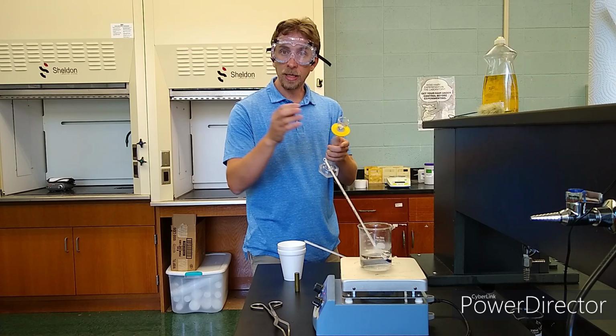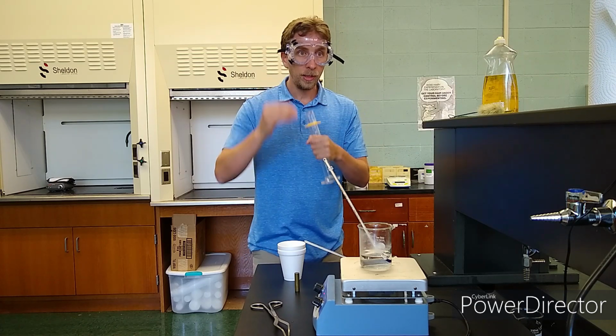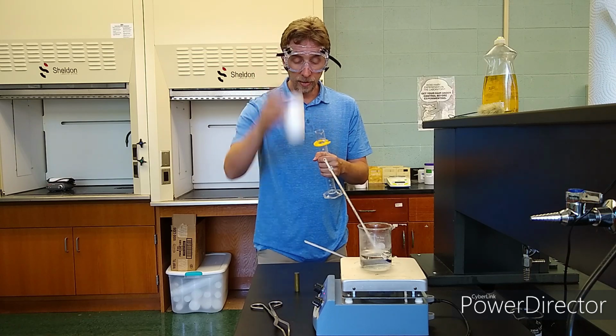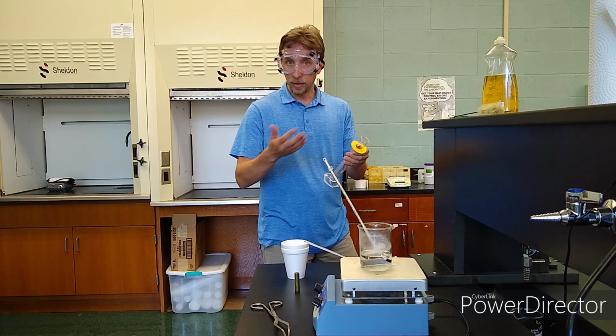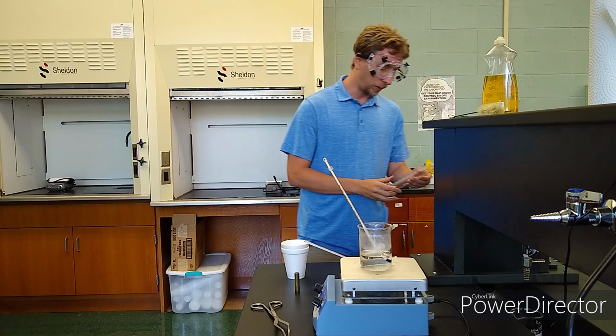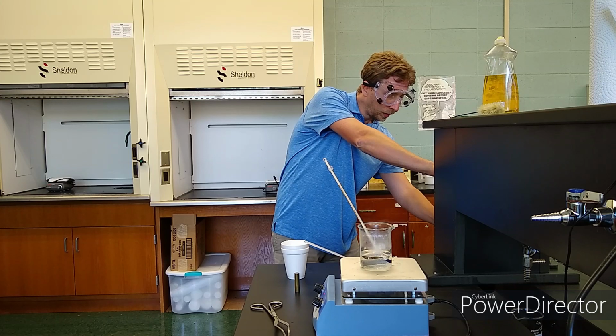I like to get less than 100 because then it's easier to change the temperature of the water. A bigger temperature change inside the calorimeter is easier to measure and get better results. So if you put 100, you can still get okay results, but I like to put around 75 or 100. So let's see here.